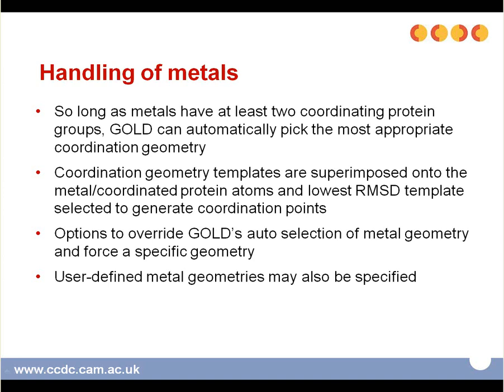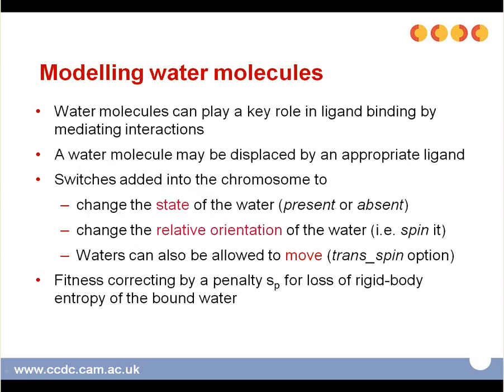If GOLD doesn't get it right — although generally it is very good — or if you have a geometry that the metal must absolutely have, you can override GOLD's metal geometry and specify your own geometry explicitly. Alternatively, for awkward geometries such as square planar, you can define your own geometry.